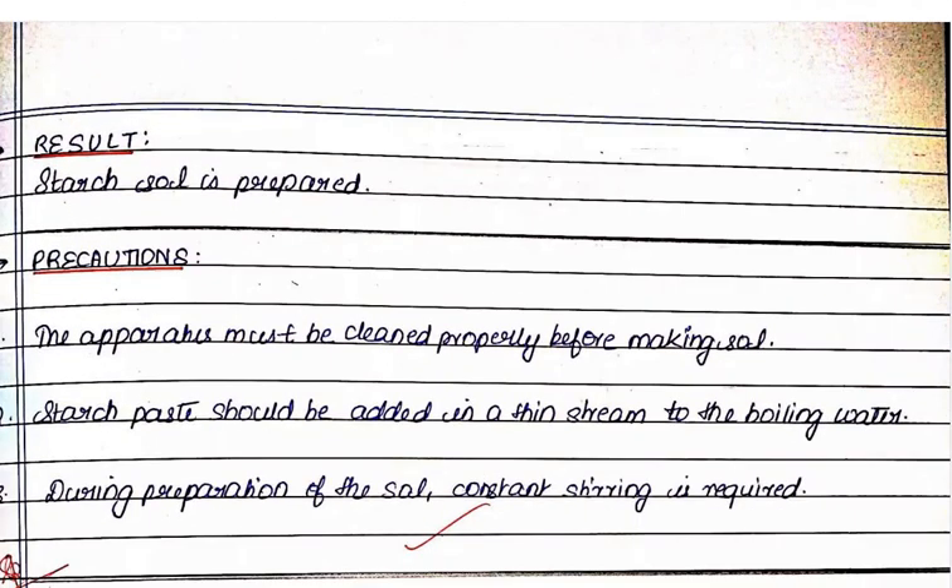Then you have to write the results of this experiment: starch solution is prepared.